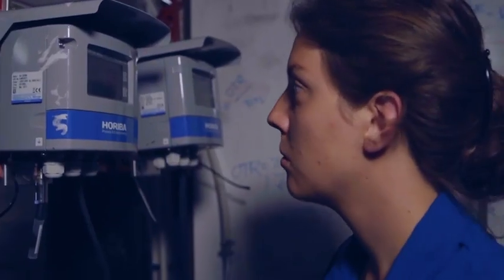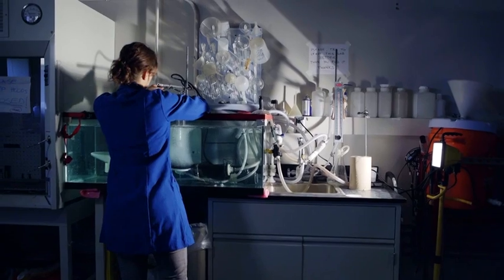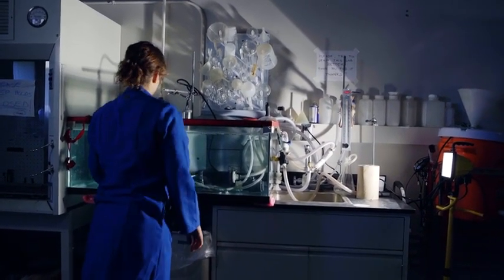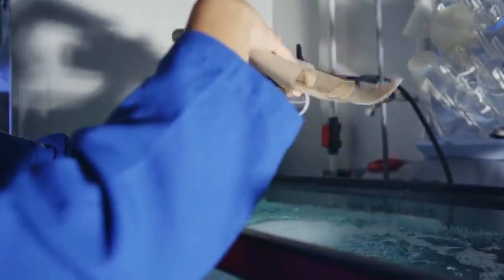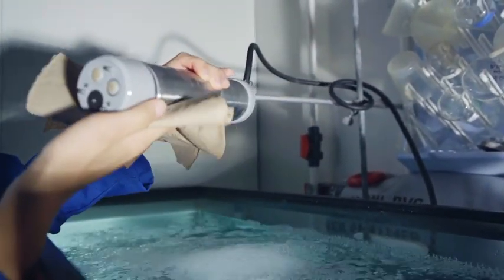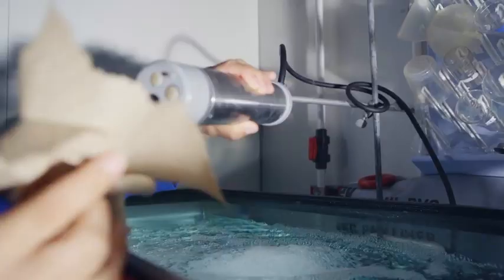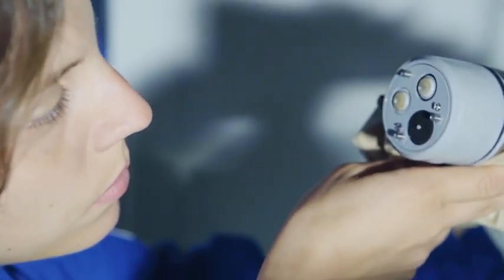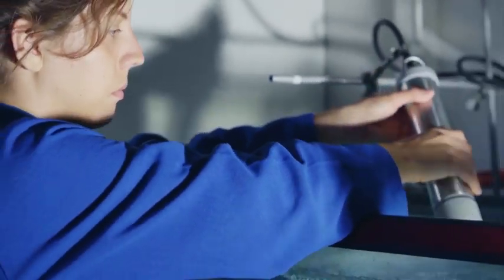And we use a number of these analyzers, including the ones from Horiba, of course, and we use them mostly to evaluate what are the contaminants in the water, how much we have removed from the oxygen demand, for the contaminant load in the water. And we can calculate also how much energy is required to treat certain contaminants. It is very important to maintain the economic and environmental sustainability of the process while removing the constituents, the polluted water.